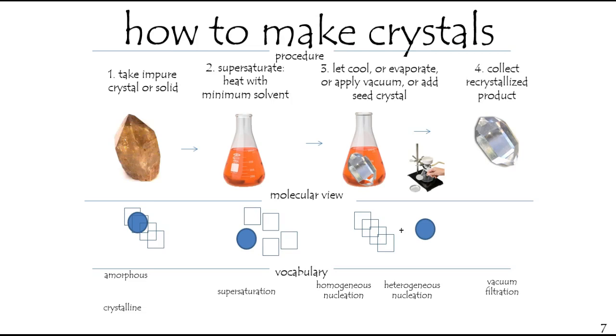It's time to collect your product. I'd recommend vacuum filtration, but gravity filtration will do in a pinch. The impurity goes through. The material is separated at this point. You can collect your product, and you now have the clean product.